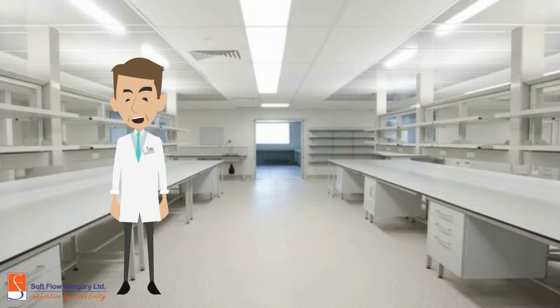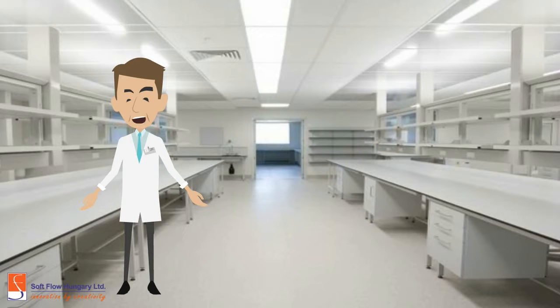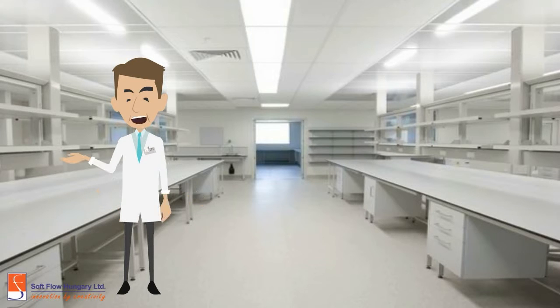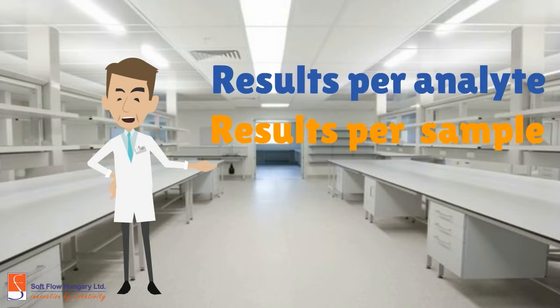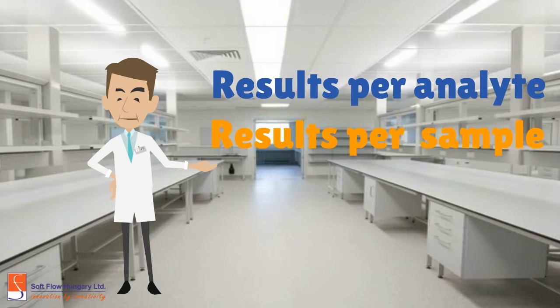Now, you arrive to the results part. You can see the results in two different ways: results per analyte and results per sample.